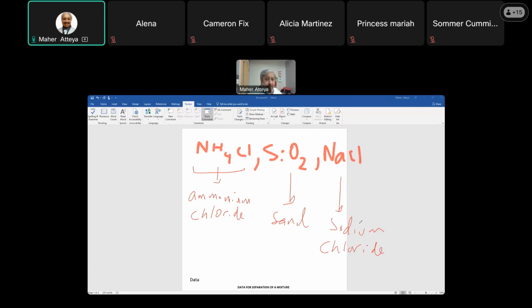So a mixture of three. This is, as you can see, not a homogeneous mixture, it's a heterogeneous mixture. Just for the fact, if you look at it, I'll open it for you here so you can see it. You have a brownish, grayish brown color here. This mixture is made of three; the ammonium chloride is white crystals, just to let you know, all those are solids.